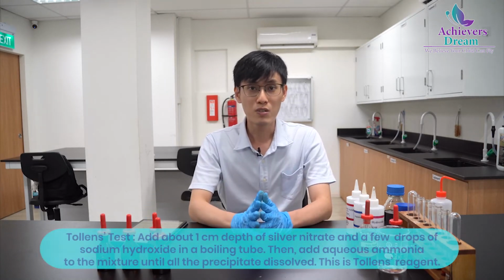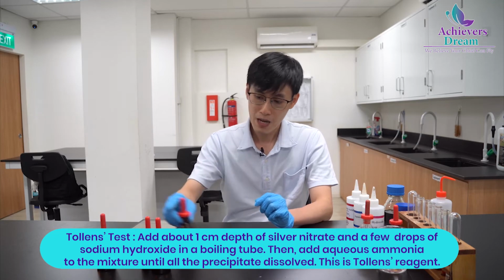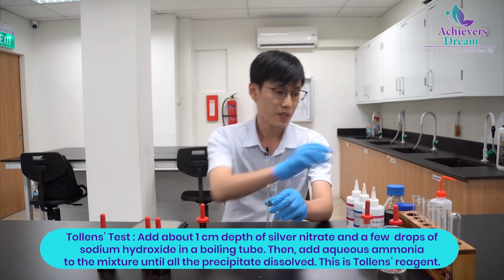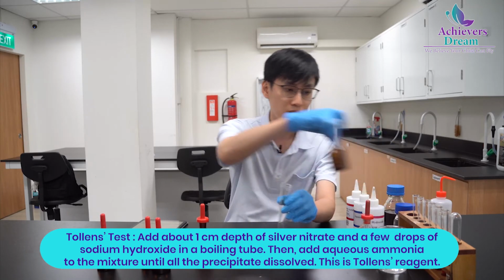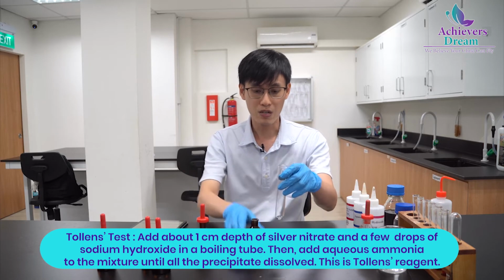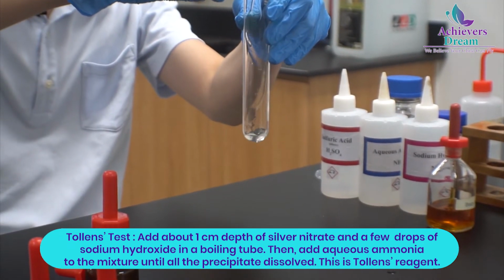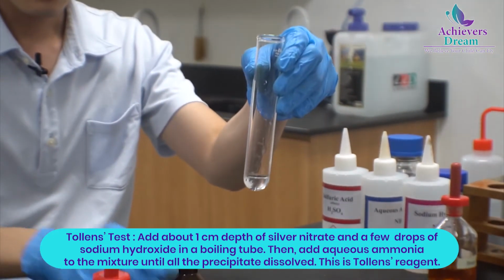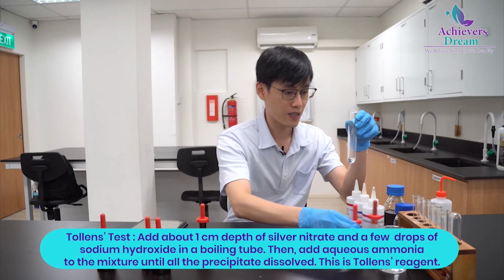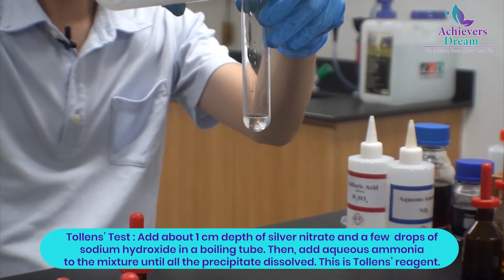The next test we'll be doing is the Tollens' test. The Tollens' test on Fa3. So I'll be preparing my Tollens' reagent right here. We'll be adding some silver nitrate, about 1 cm depth. So I'll be pouring it into this boiling tube right here. After that, we'll be adding some sodium hydroxide. That will cause silver oxide to precipitate.